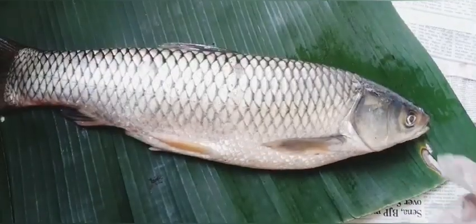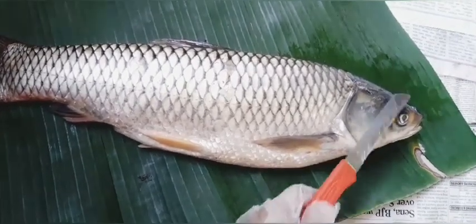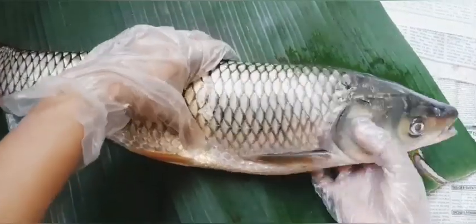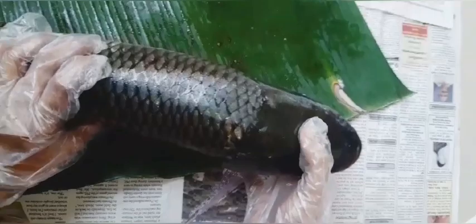Now let us come to the fish head. The head of the fish is very hard. It is made up of strong bones. As you can see, these are the eyes, and generally the brain is located in between the eyes, maybe here. And you can see that there are some nostrils. Generally a fish has one nostril on each side, but some fishes have two nostrils.